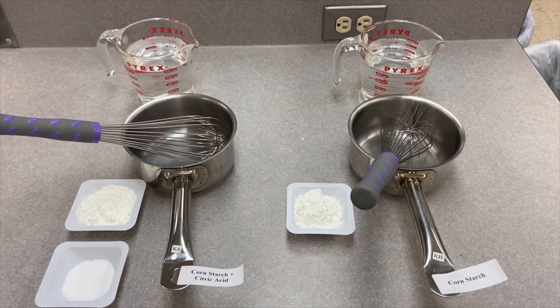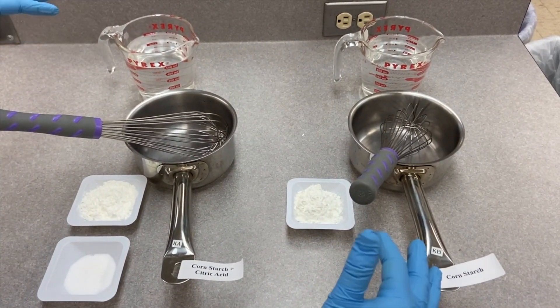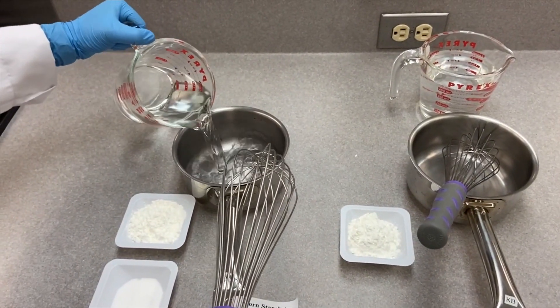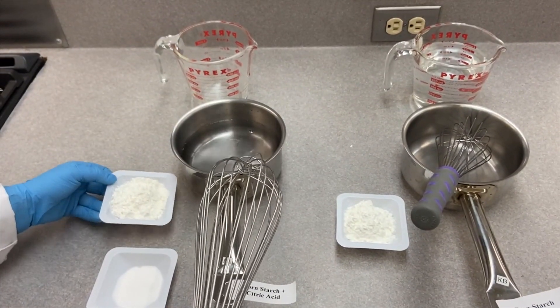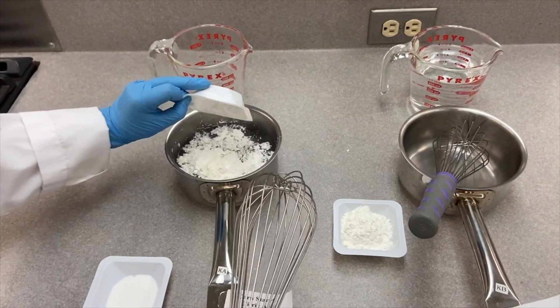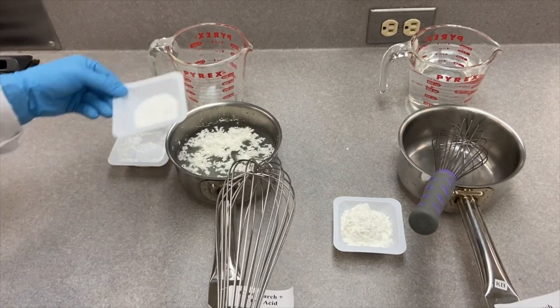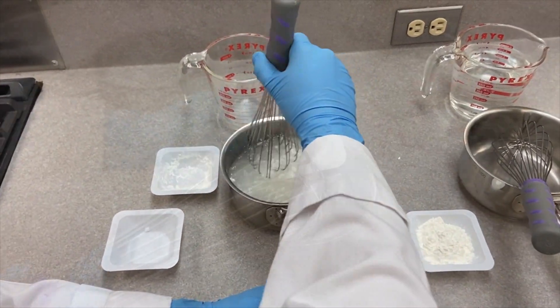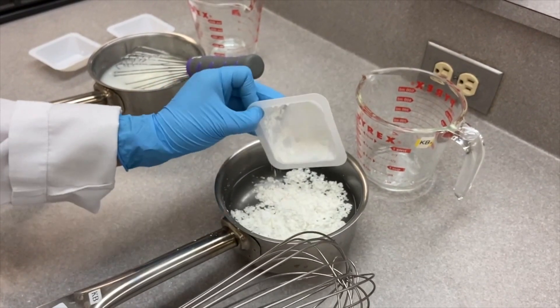Both samples have 500 milliliters of water. We're going to pour the water and mix. This is the one with the acid. We have the same amounts of cornstarch, and now I'm mixing the cornstarch with water without acid.